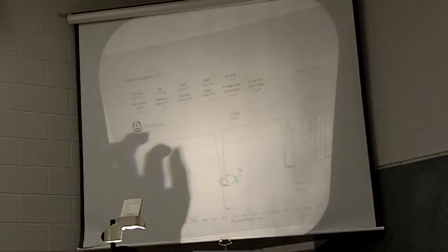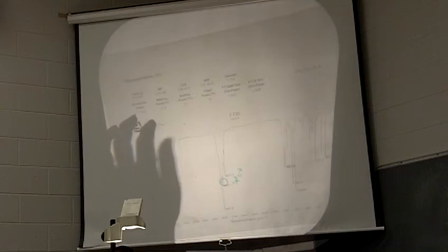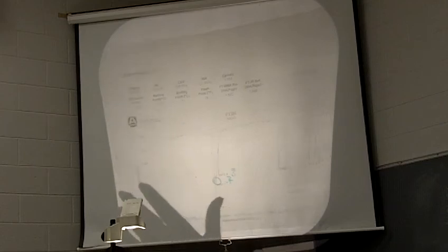Yeah. Would we be expected to memorize how to point these out, or just expected to look at a reference and understand? You should have a general idea of where they are and where you can find them. Okay? You should also know what the chemical tests are testing for and what the results are you should expect. Okay? All right, so there's the alkanes.